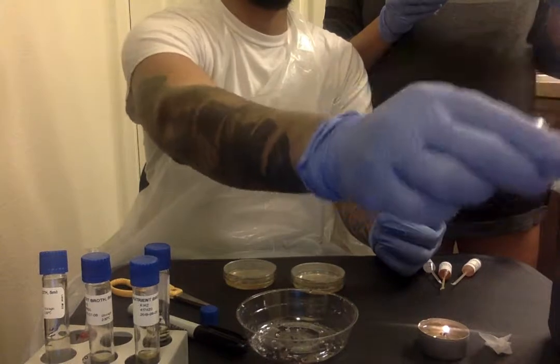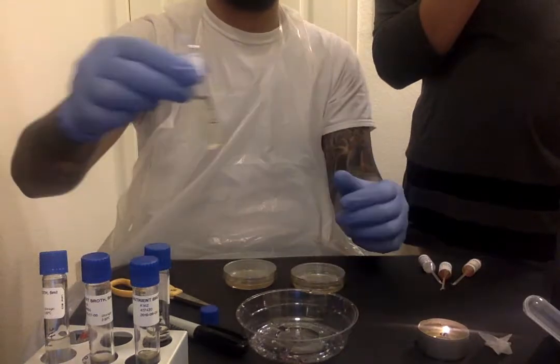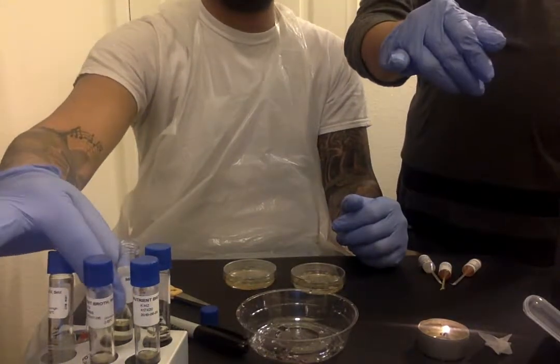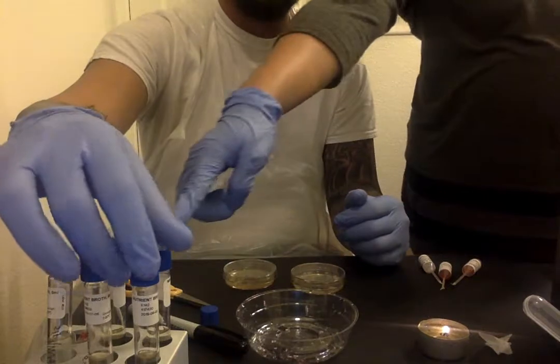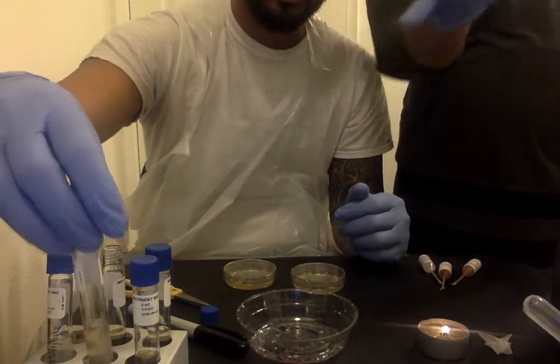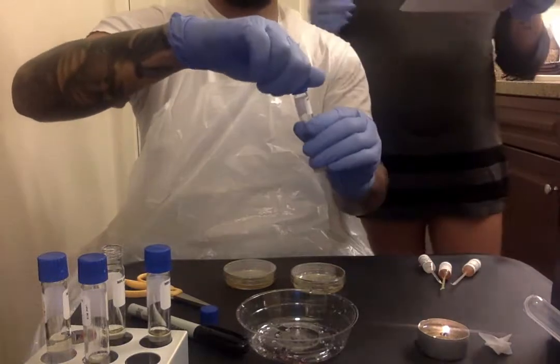Carefully — oh, I'm sorry — open up the E. coli one, you can put it back right there. Open up the E. coli one as well. No, no — the active broth. This one is active. Open up and then sterilize it.